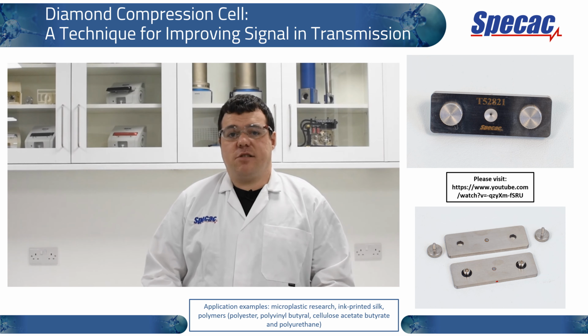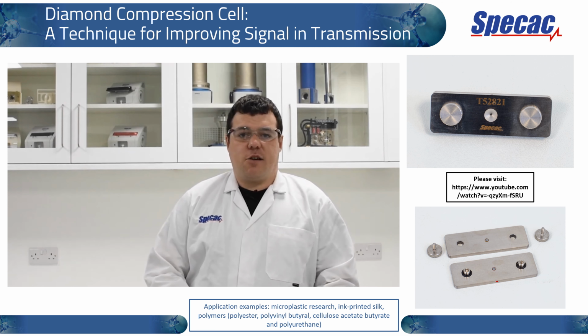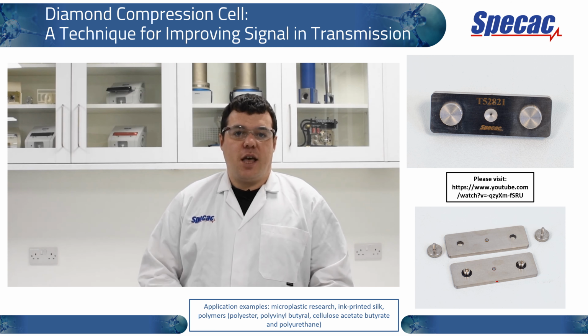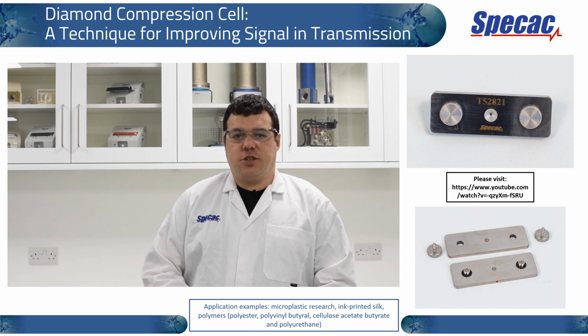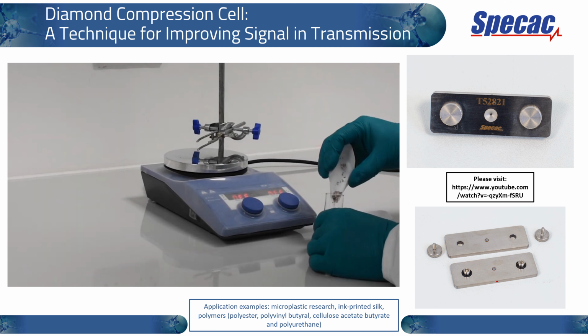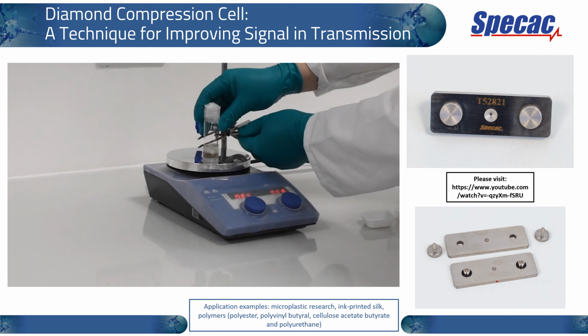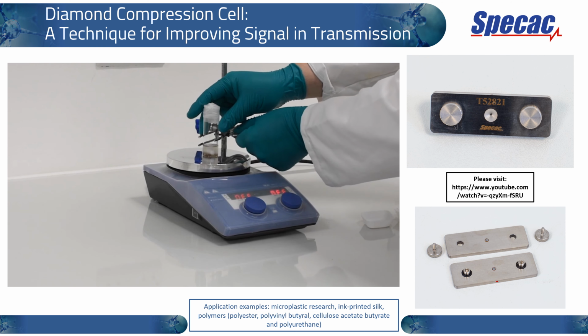So what is a current novel IR microscopy challenge? Well, microplastics are a growing environmental concern, and their identification is an essential first step in their eradication. In order to simulate the sea and make microplastics, we stirred a vial of water with different plastics and grit for a week at 60 degrees.